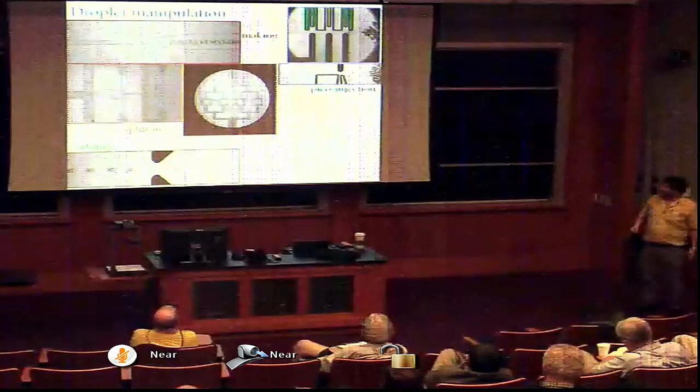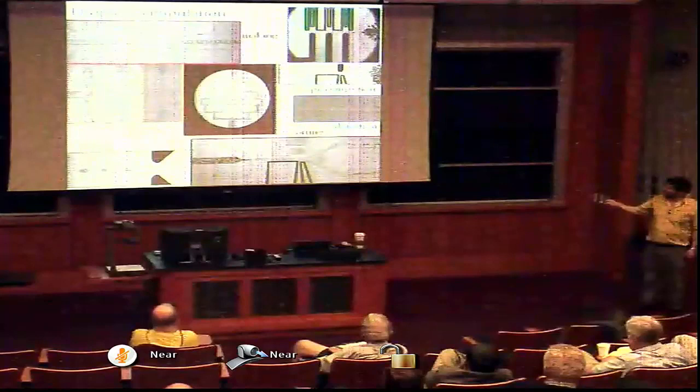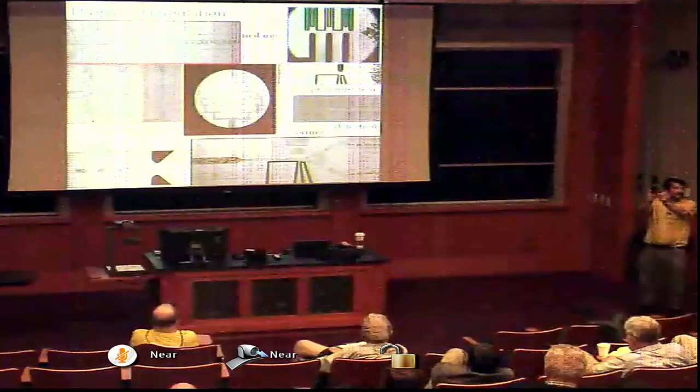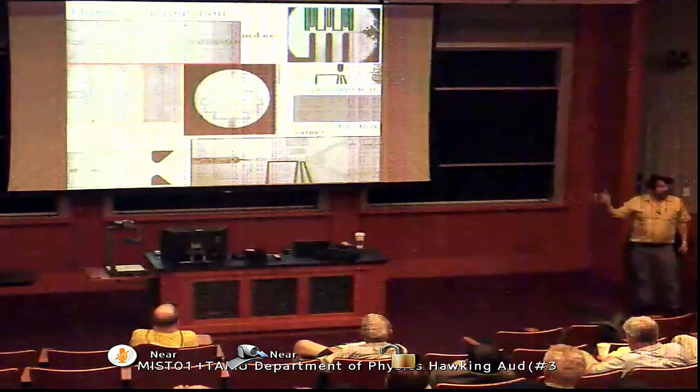We can detect. We use optical detection. If you really want to screen something, you should be able to choose things. So we built this very sophisticated device. This is a sorter. This has a little laser detector. And now we're inducing an electric field. If we want to put a force on it, the electric field will induce a dipole, and to put a force on the dipole, we need a gradient of electric field. So here we use a gradient electric field, and we can pull any drop out. We can pull 1 drop out at 5,000 per second.